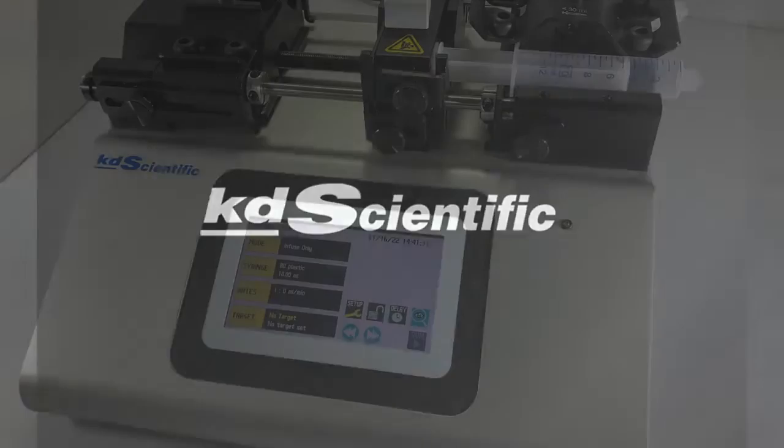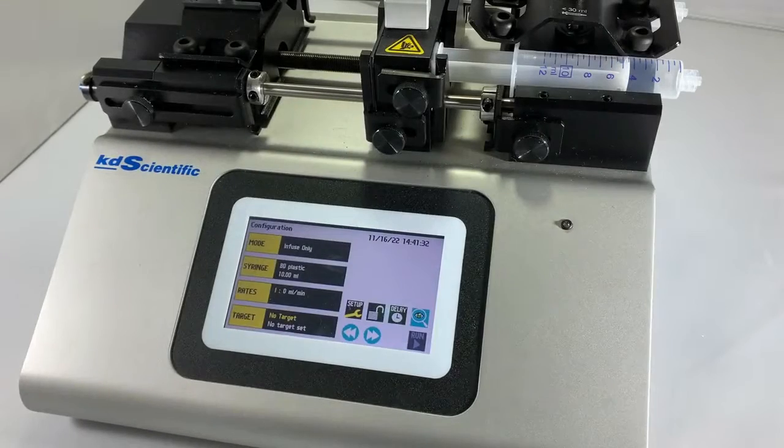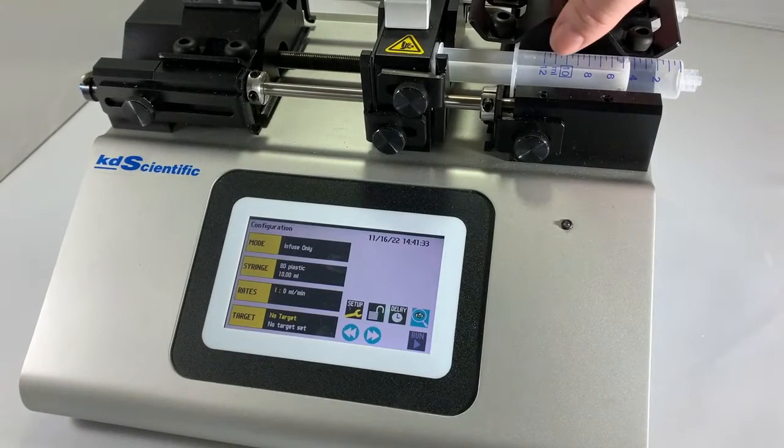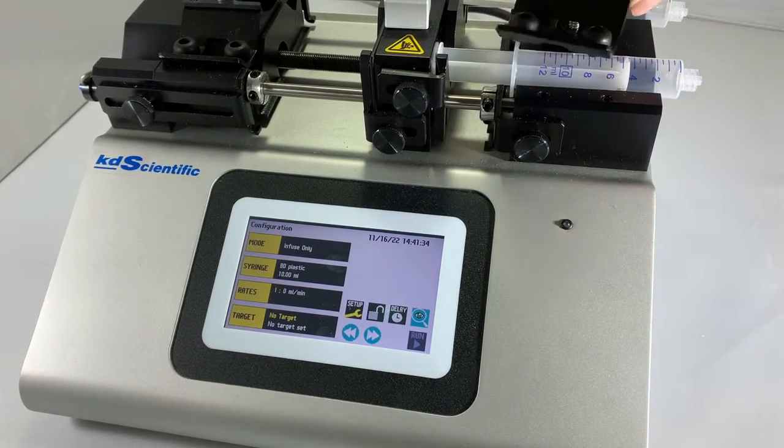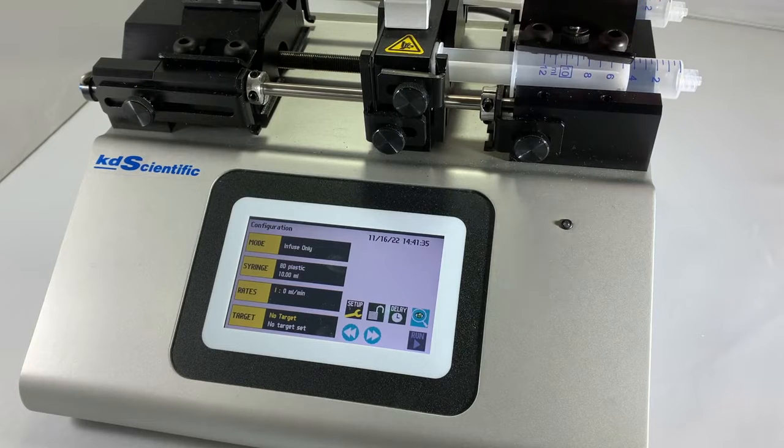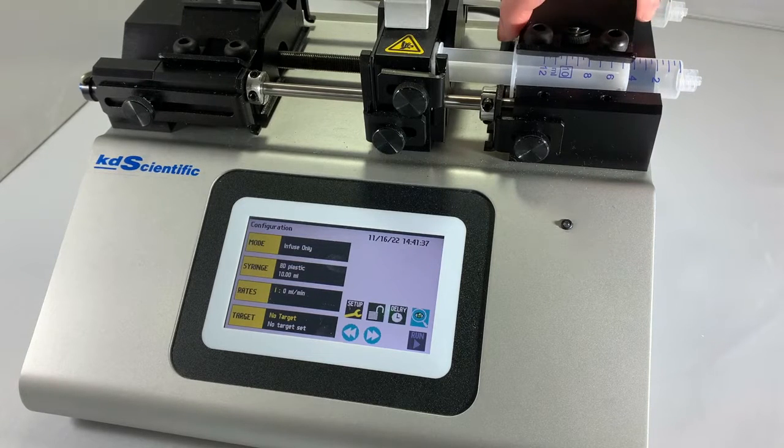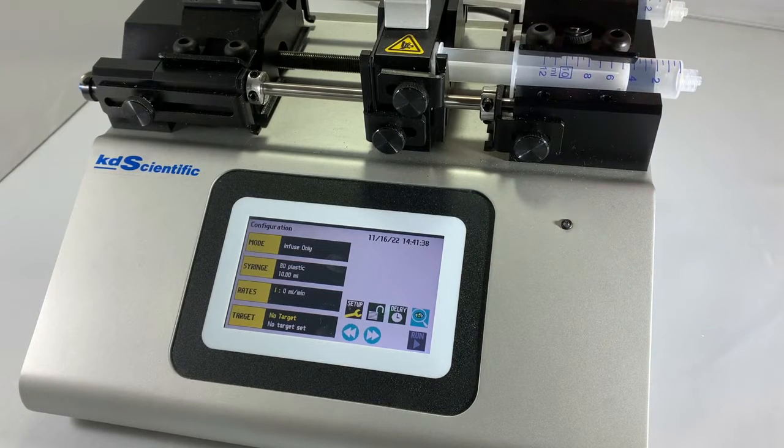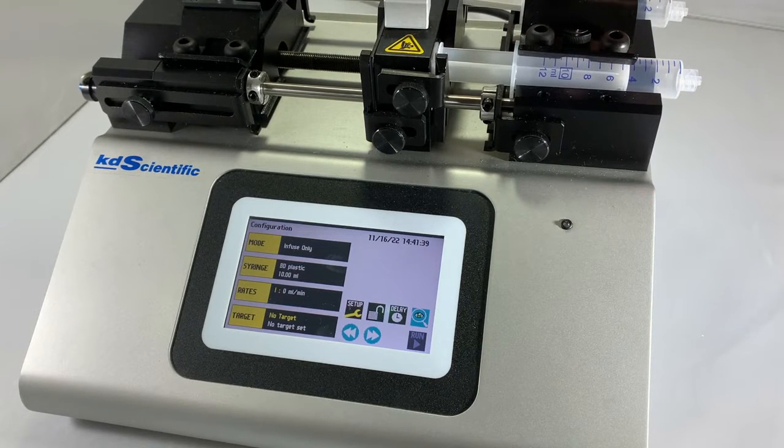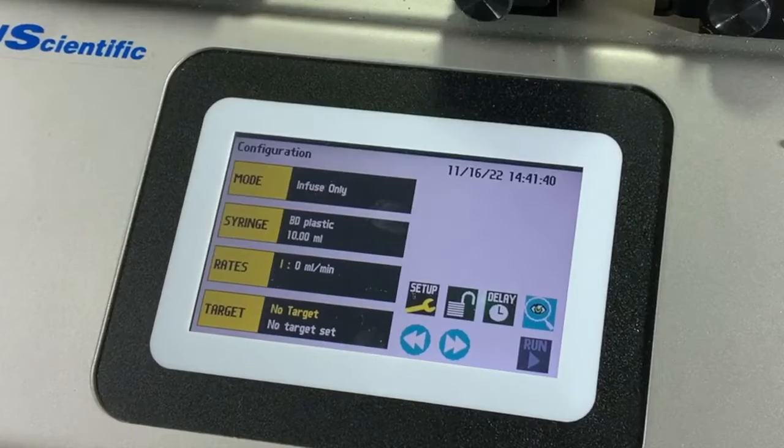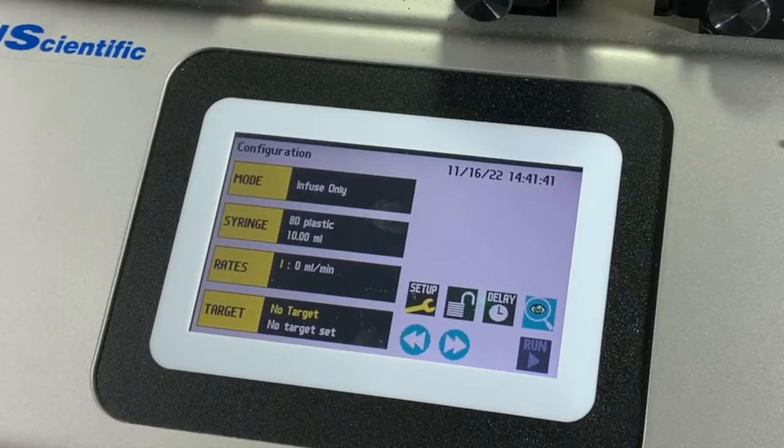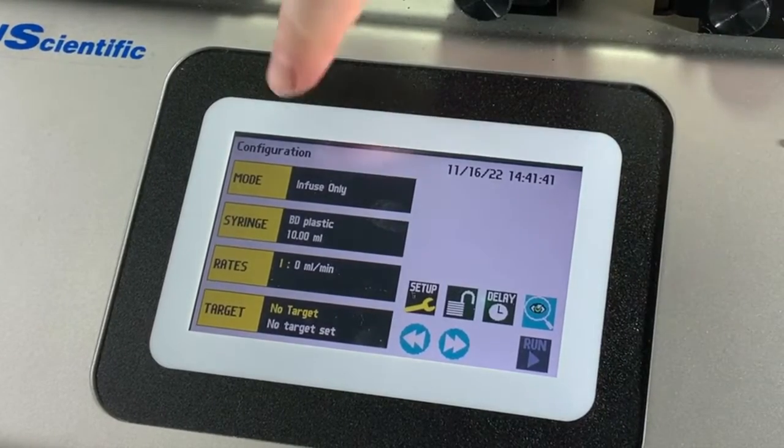In this video we're going to show you just how simple the KD Scientific syringe pumps are to use. First, all you need to do is simply insert your syringe using the clamp on top and then the menu will intuitively show you step by step.